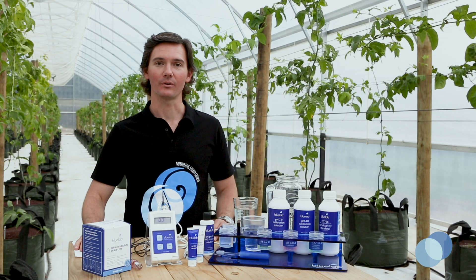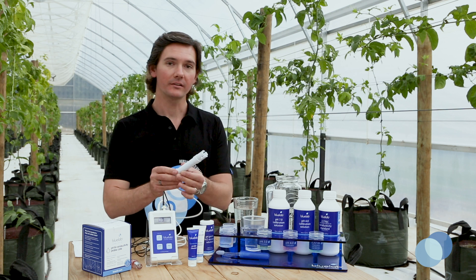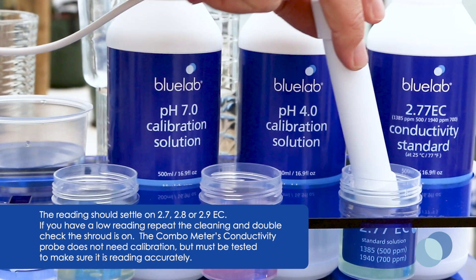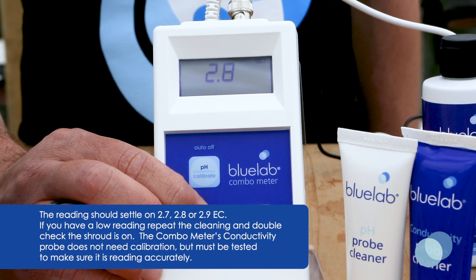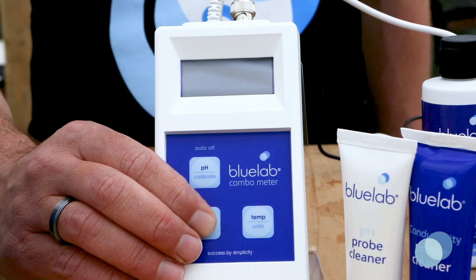Now let's test the conductivity probe. Press the nutrients button on the combo meter. Take the cleaned conductivity probe and put it in fresh 2.77 EC solution. The readings should stabilize on 2.7, 2.8, or 2.9 EC. Or if you're using the 500 PPM scale, 1350 to 1450 PPM. Or on the 700 PPM scale, 1840 to 2030 PPM.